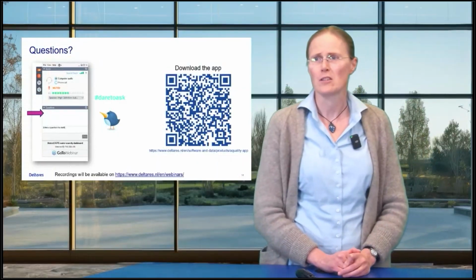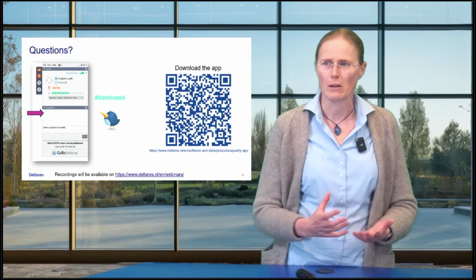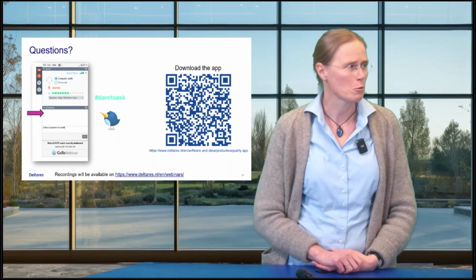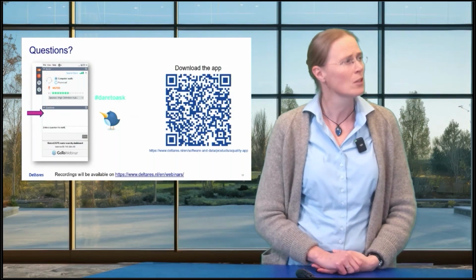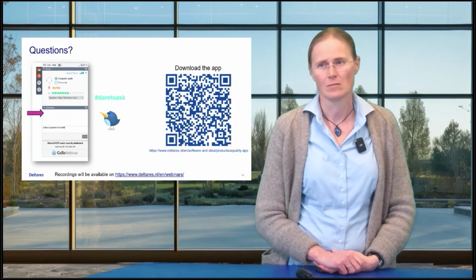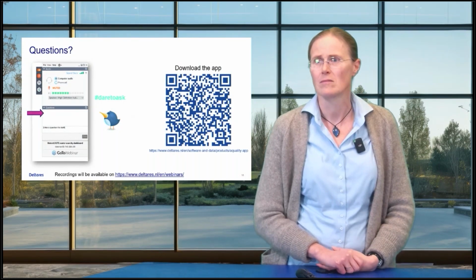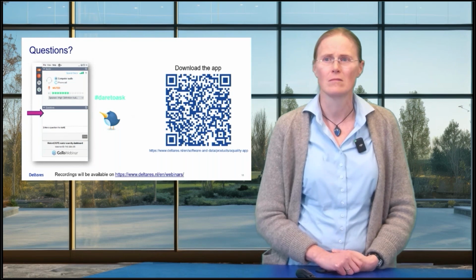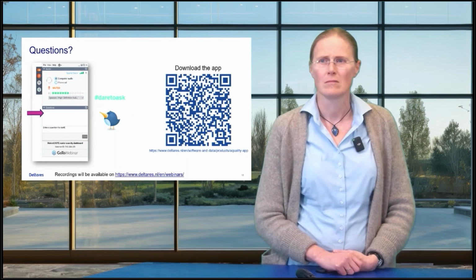And there's another question also related to what are the parameters that you can sample, like for example, are other parameters also considered, such as pH? Yeah, we have been considering pH and also some others. For now, we have these four, so nitrate, EC, phosphate, and ammonium.